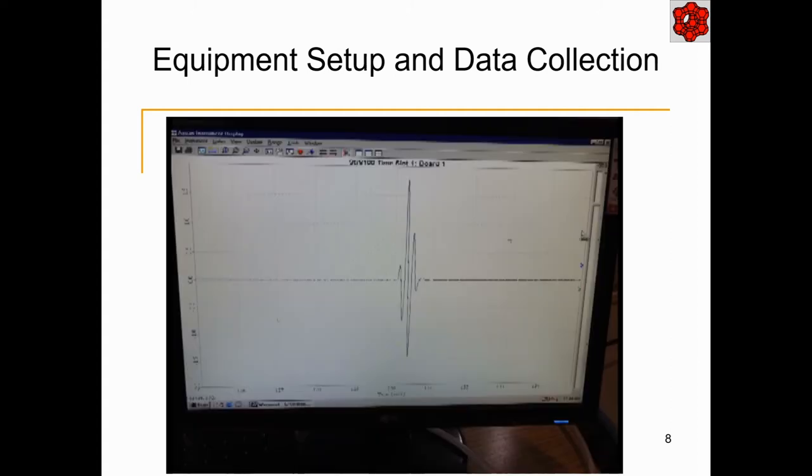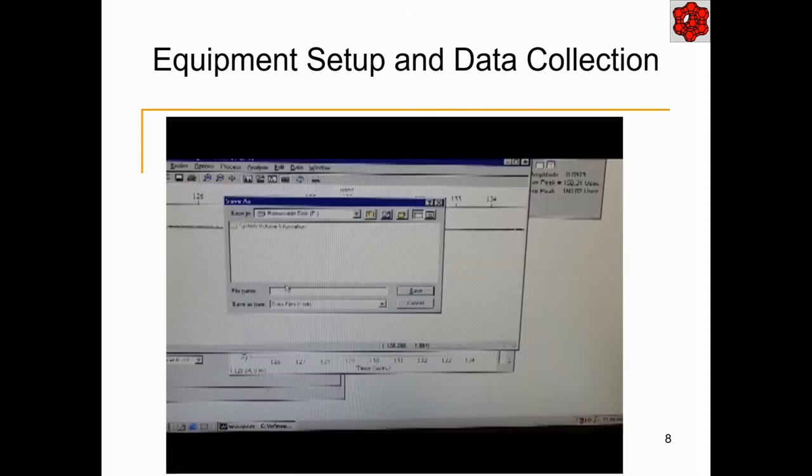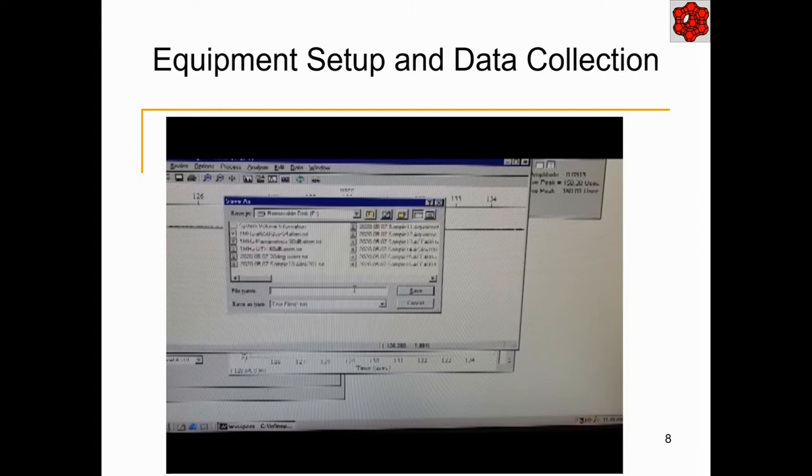The A-scan of the water path without any sample is then captured and saved to a file with suitable information to identify it. In this case, the signal is just the water, so perhaps water 20 degrees could suffice as the file name.